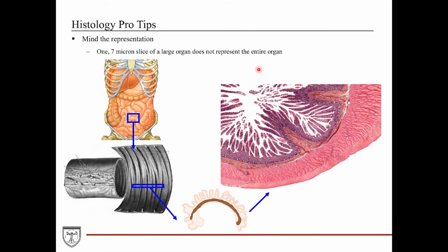So we have to be mindful when we get a big tissue specimen to regularly sample and provide enough tissue slides to get a good representation of that surgical resection. The next tip has something to do with the dimensionality. Typically, tissue images are 2-dimensional representations of 3-dimensional structures.